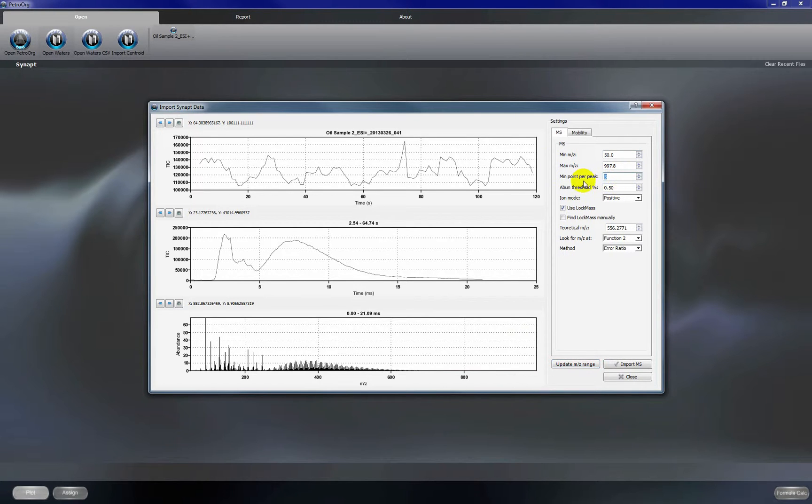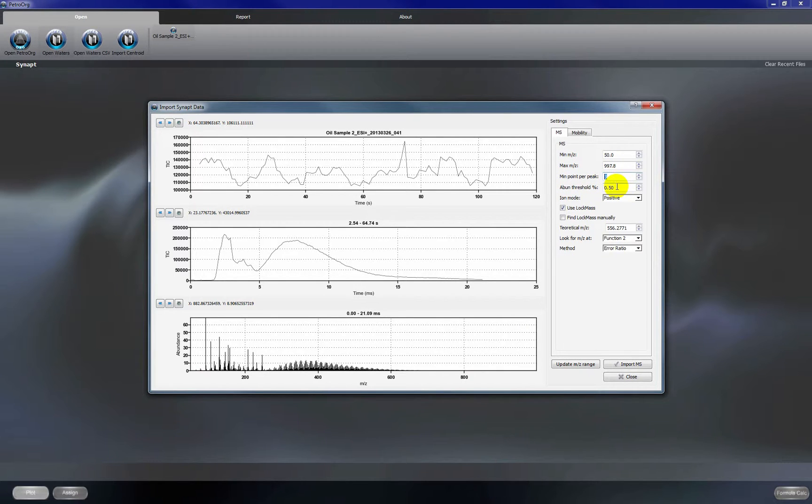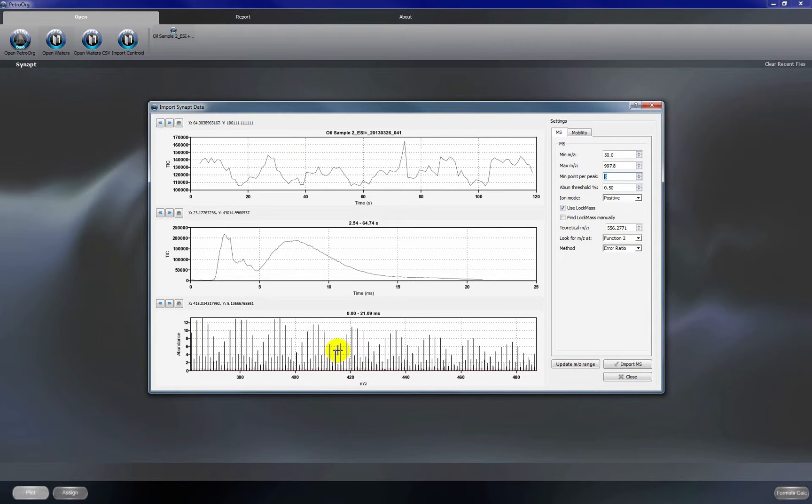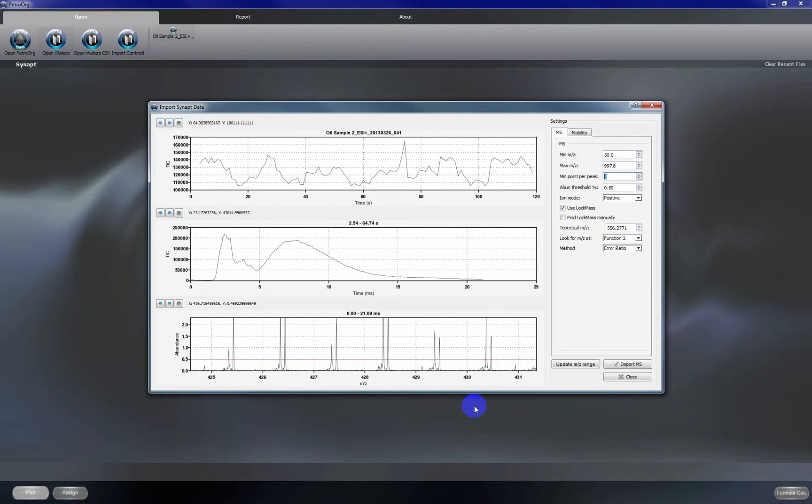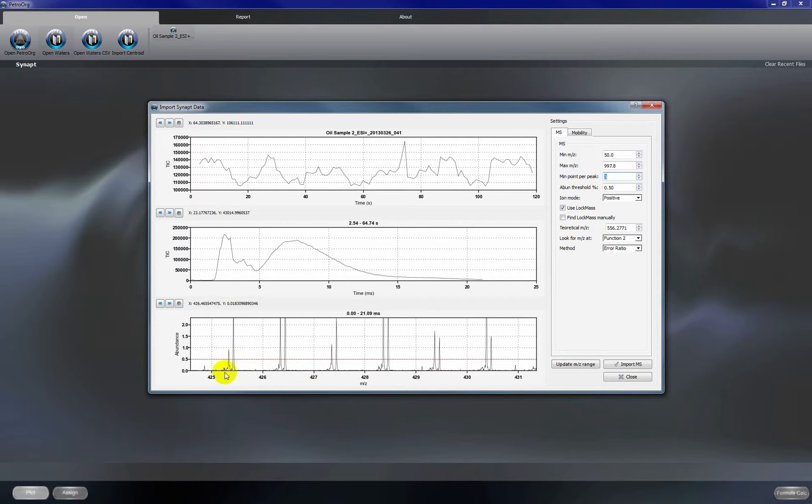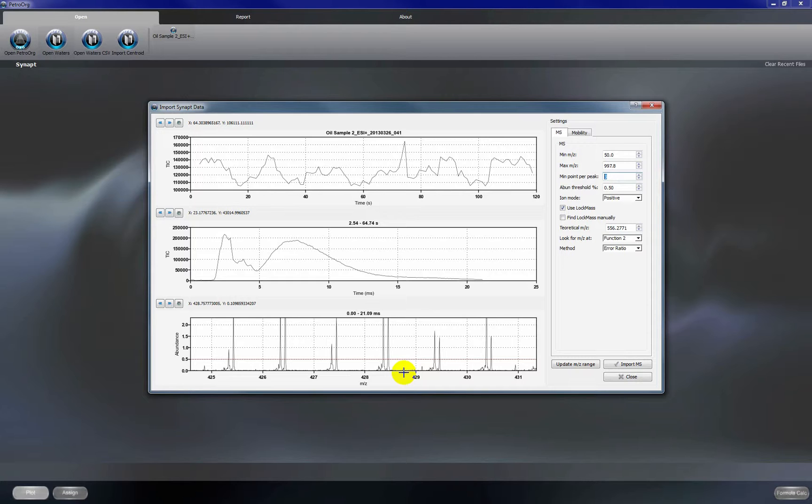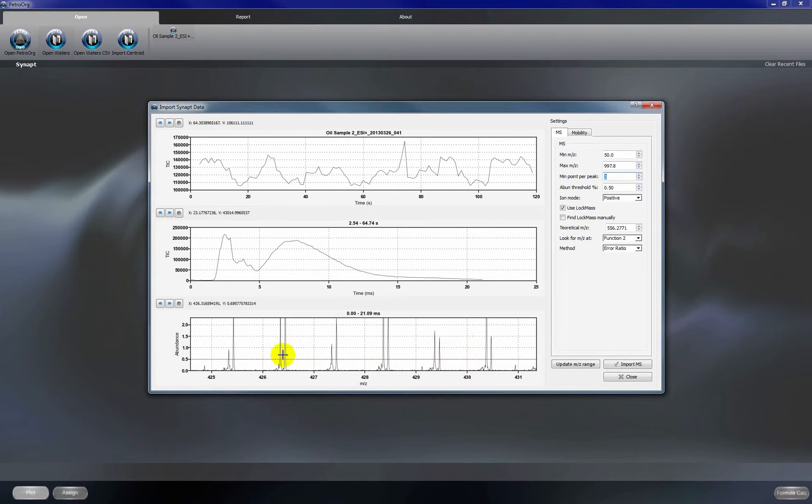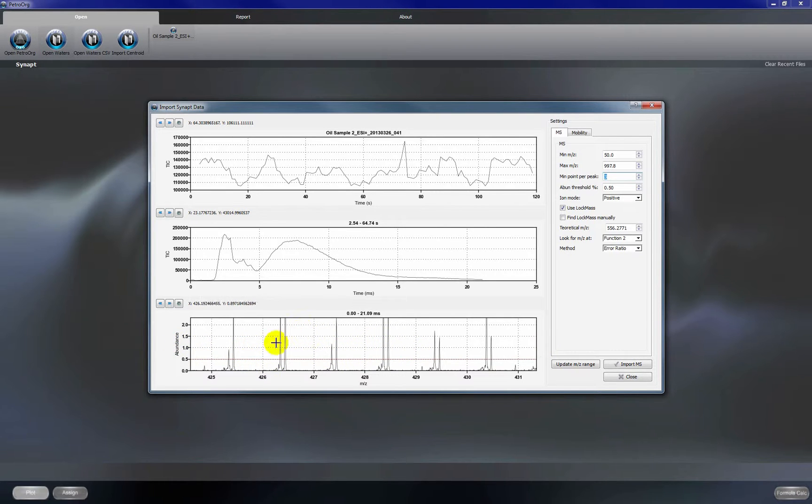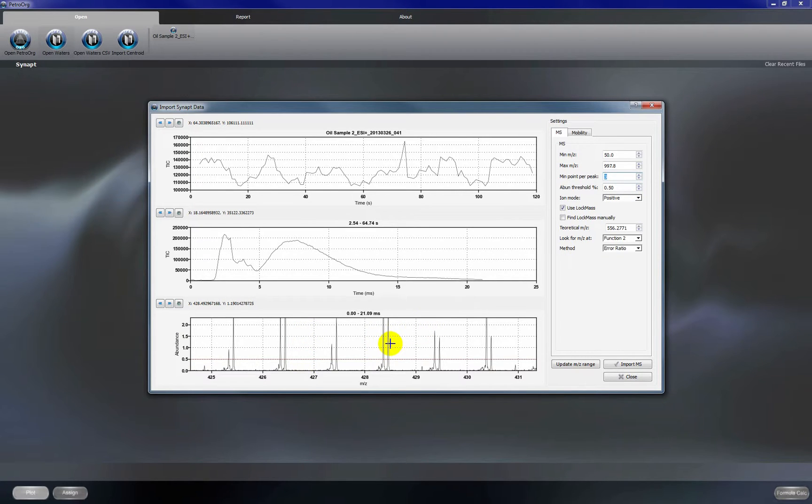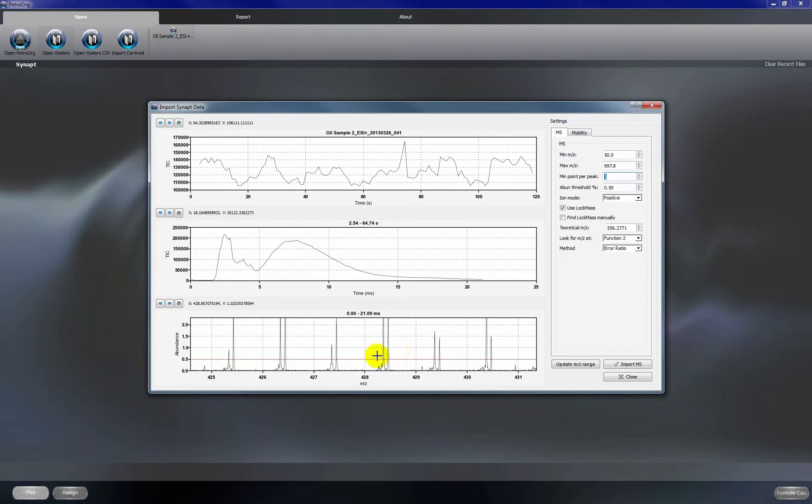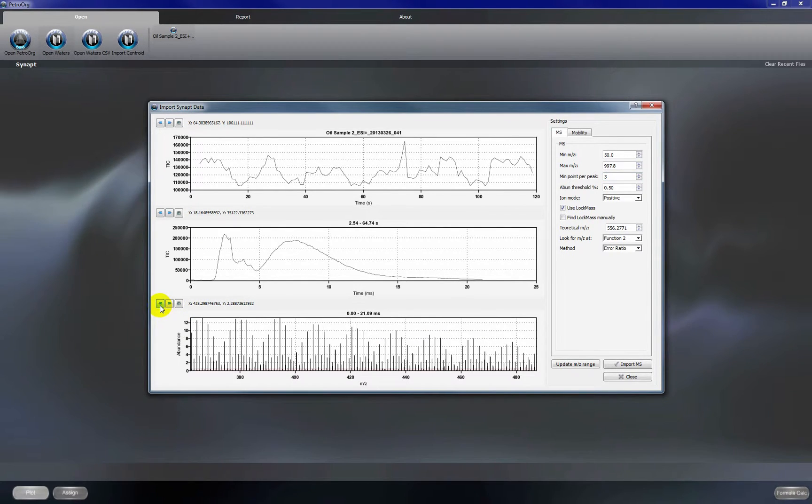We're going to make sure we have three points per peak and your abundance threshold you're going to determine by zooming in to a few regions across the mass spectrum and looking to see what is a value that will be high enough where we don't collect a bunch of noise but low enough where we see and actually select the majority of the peaks in the mass spectrum. So for this sample 0.5 is going to be a good number for us. For other samples you may have to change this around based on the quality of your data.